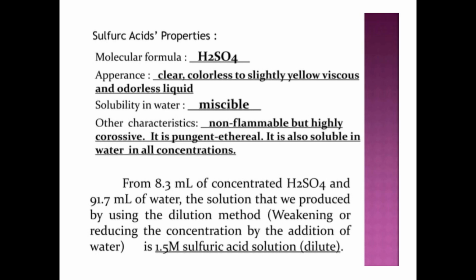So the description is also that if you have been able to measure 8.3 ml of conc H2SO4 and 91.7 ml of water, and you mix them together evenly, the solution we have produced using that dilution method is 1.5 molar sulfuric acid solution.